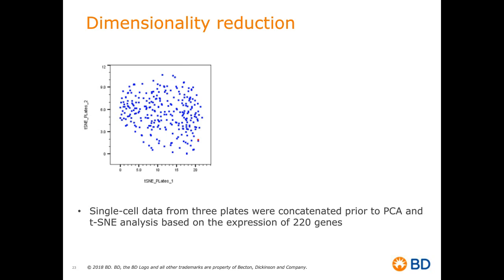However, we are not able at this point to determine which cell is an effector memory, a naive, or a stem cell memory. At this point, we are just performing a visual assessment of the cells. But now we can take advantage of the protein expression information that was recorded at the time of sort via index sorting to overlay this information on the t-SNE plot and define where in this bidimensional analysis each cell population falls, based on the correlation of protein and gene expression analysis.